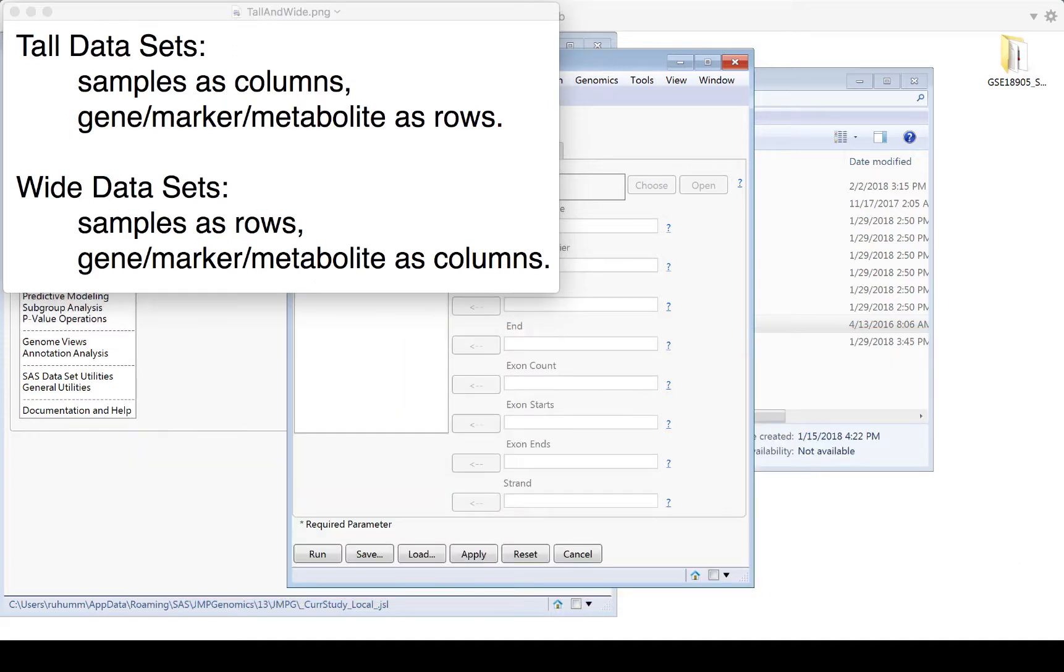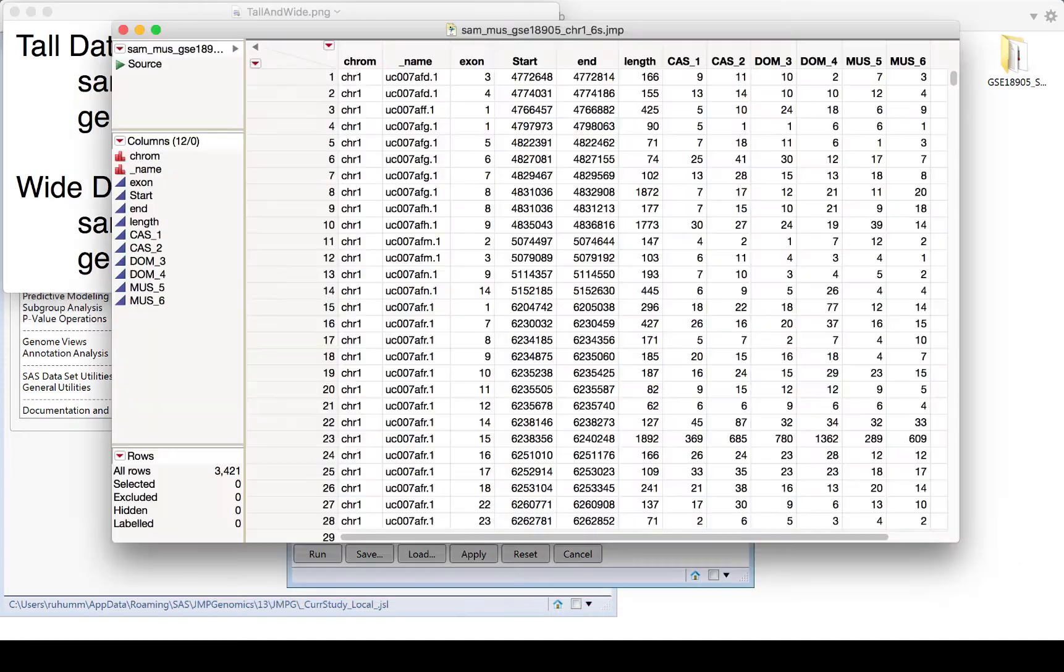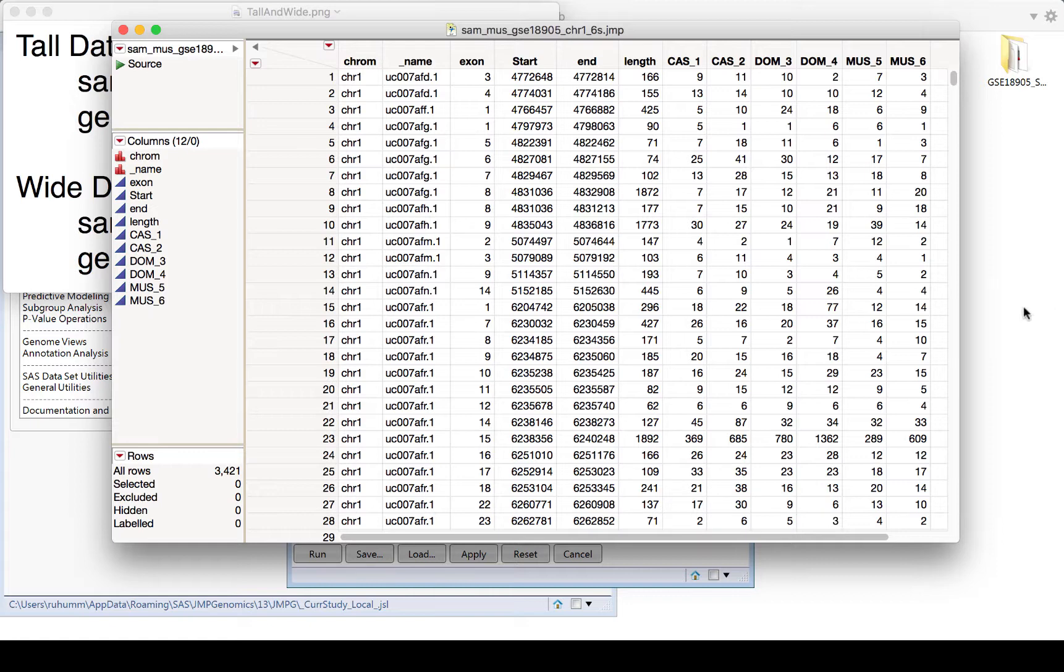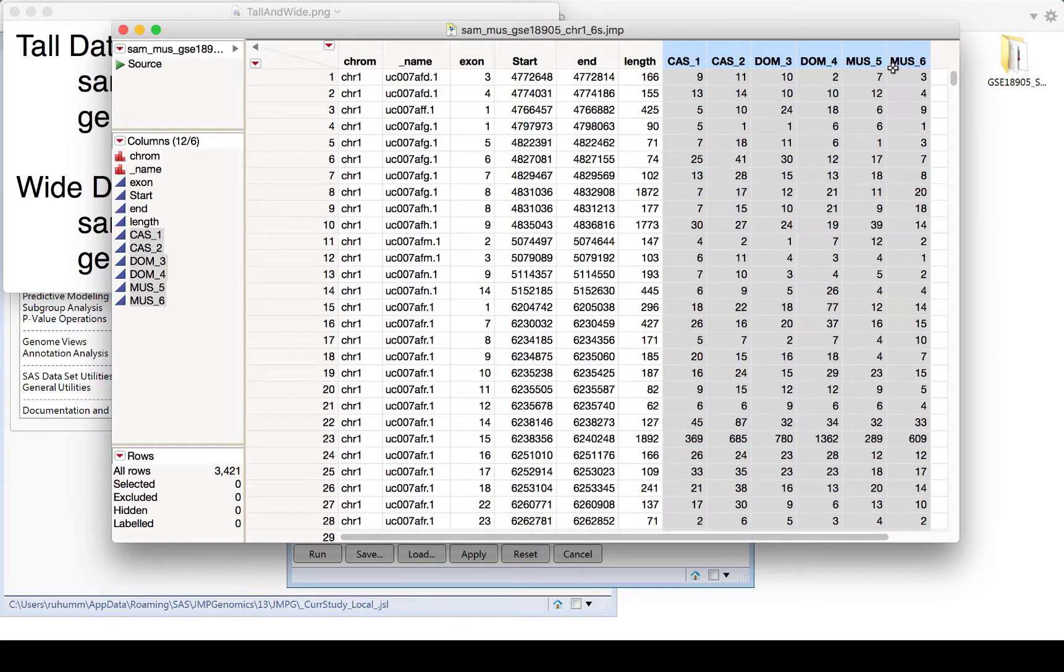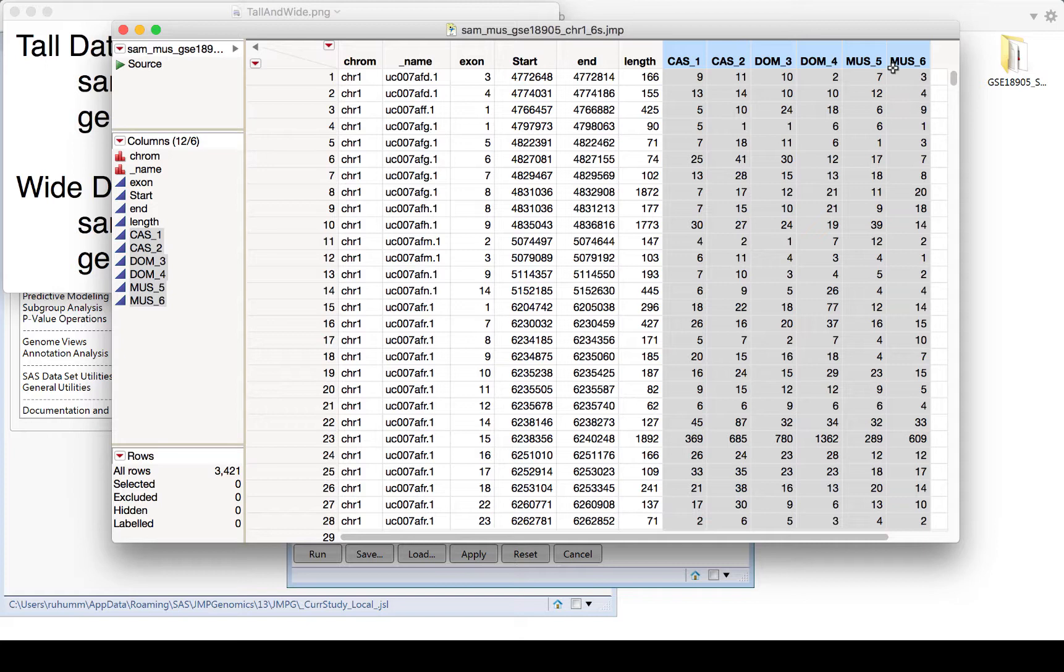Here is an example of part of the imported and merged data and annotation for the mouse experiment we've been looking at. We can see the six samples are the columns and the rows are the genes of interest. The corresponding annotation information also got added to this file, so you can see that the first columns are from the annotation information. Because the samples are in the columns and the genes are in the rows, this is a tall data set.